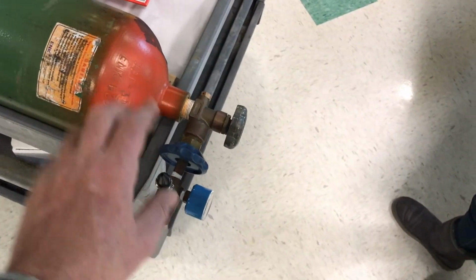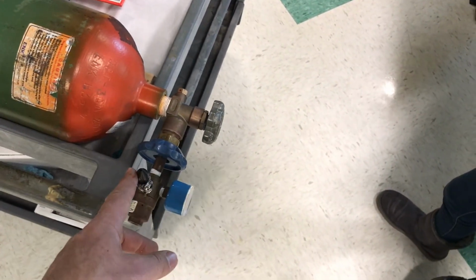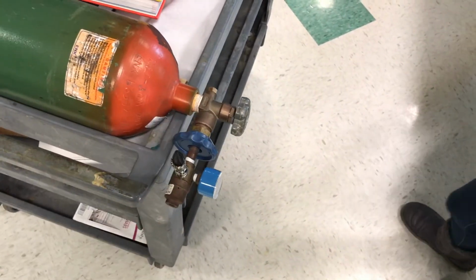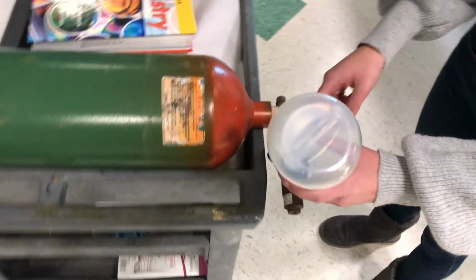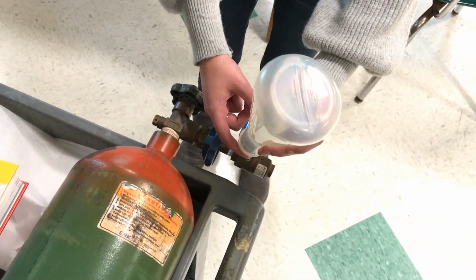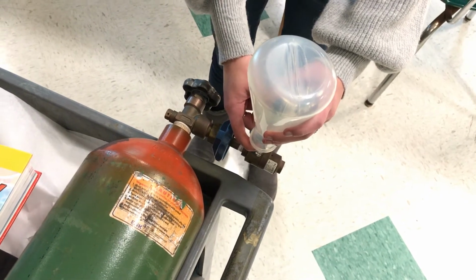Notice it's turned upside down because this gas is lighter than air. So all you've got to do is bend it and the air comes out. Invert your flask, and what you're going to do is flush out the air. Bend it. Make sure that your container stays straight up, because if you do it the other way, the gas is going to empty.